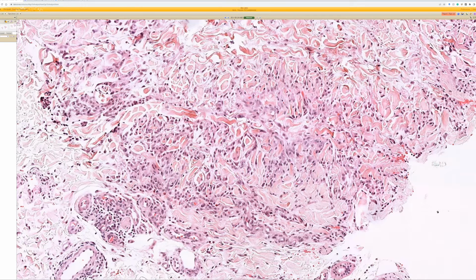I think that's an important thing for pathology-trained people to recognize, that many things that we call granulomatous in dermpath are not actually well-formed nodular granulomas, okay? What we usually mean are rich in histiocytes. Sometimes we mean just the infiltrate has a lot of histiocytes in it, and we'll call things like granulomatous drug eruption, often just has kind of an increased histiocyte density in addition to lymphocytes and some other findings, and we'll say, oh, it's granulomatous. So we use the word granulomatous and granuloma very loosely in dermatopathology, I would like to say, compared to the rest of pathology. I think so, at least. So don't be surprised by that when you start dermpath.